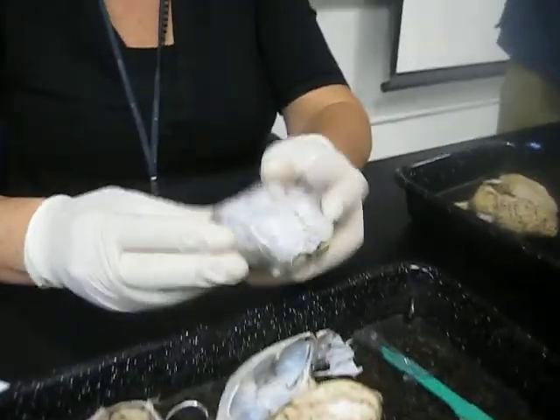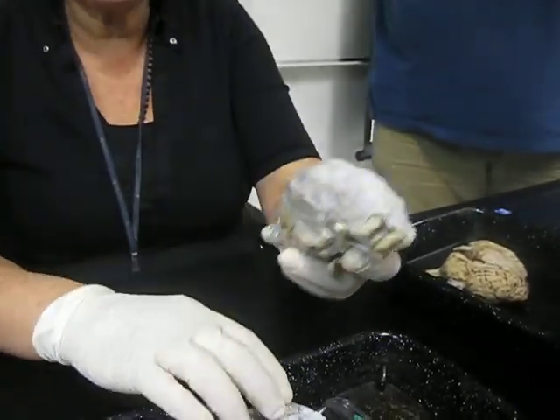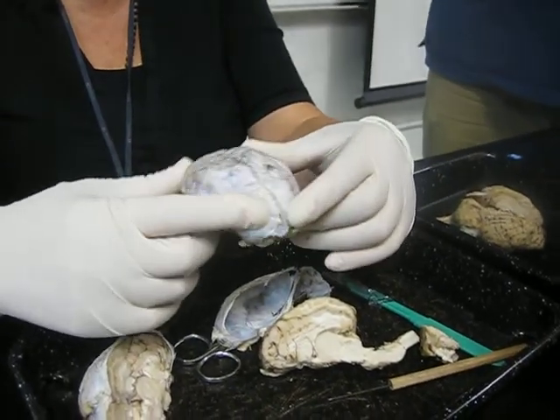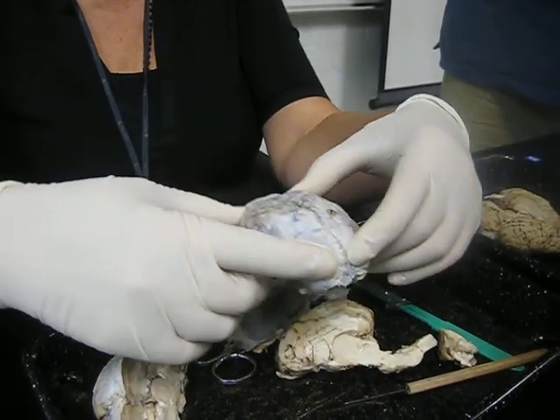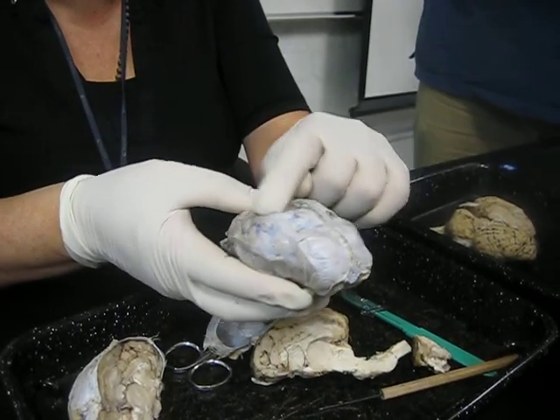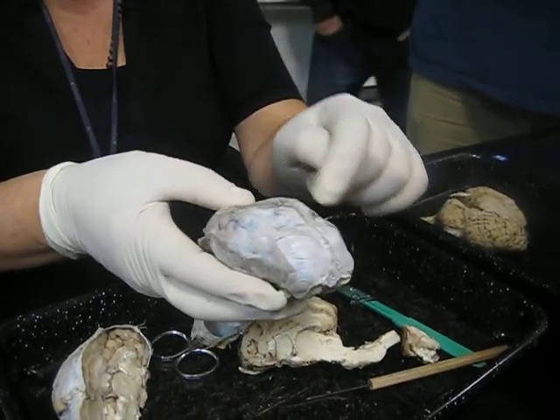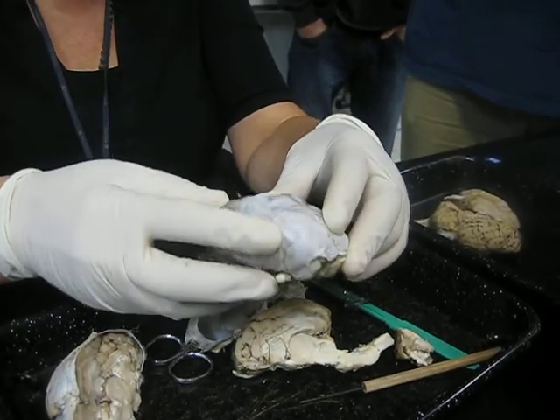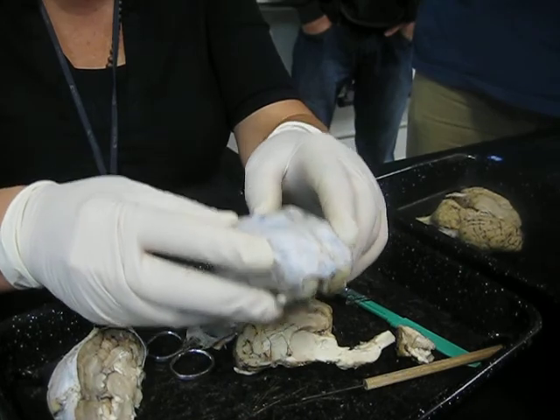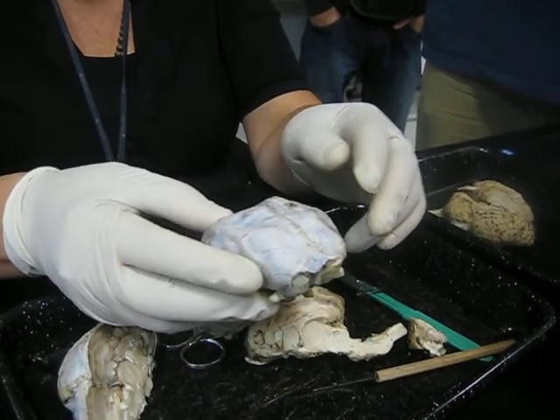Brain. This is your brain, not yours in particular, but the largest structure in the brain is the cerebrum. So all this part right here is the cerebrum. Right now you can't really see it because it's covered with what is called the dura mater. Tough mother, really tough. It's the most superficial of your meninges that protect the brain.